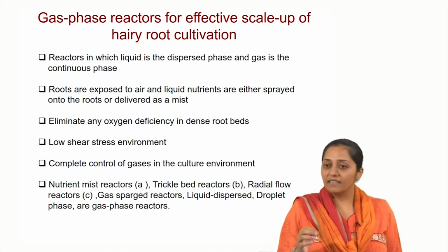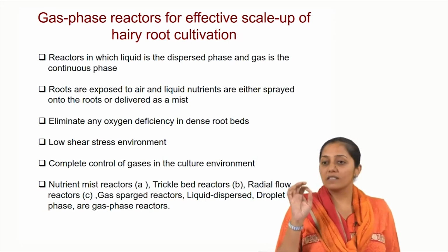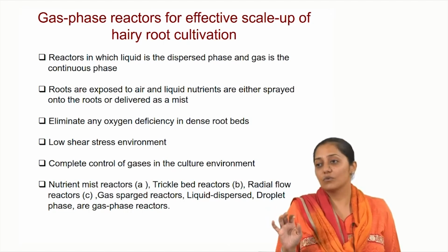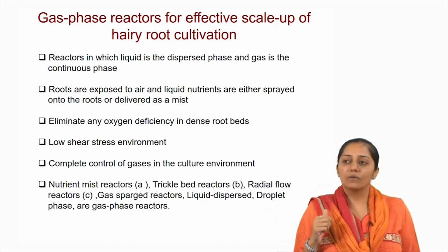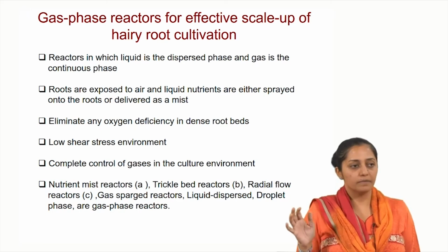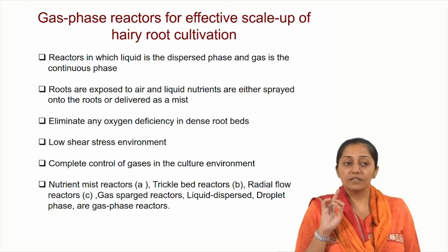And when we did this, there was significant improvement in the growth of the roots. Now, why do you think it might be helping? There is a limitation of scale up, but this was working.